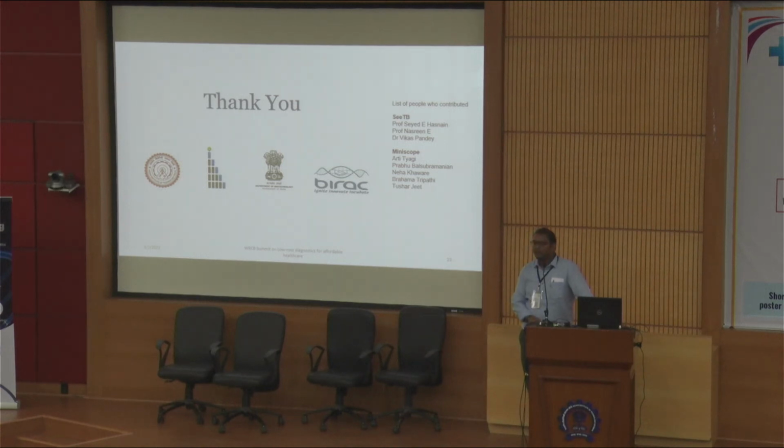I'm sorry, I'm not familiar with bovine TB, but this is basically detecting cells that are present in the milk sample. So it's probably another new set of cases that we have to examine. I'm not familiar about that.